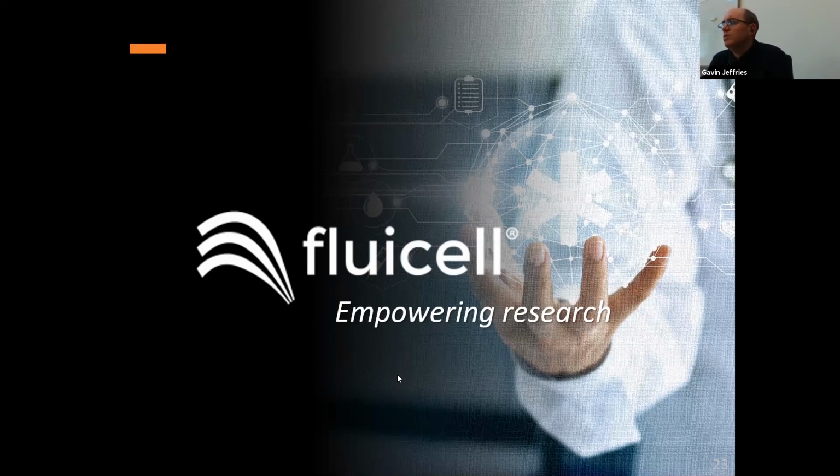in place afterwards. So you could print the construct and then expose part or a large section of the printed tissue to a particular trigger or a particular differentiation trigger compound to actually drive differentiation of one part or all of it. But if we're doing it after the fact, the exposure time would need to be within minutes to an hour or two. Longer than a couple of hours is quite challenging to maintain.